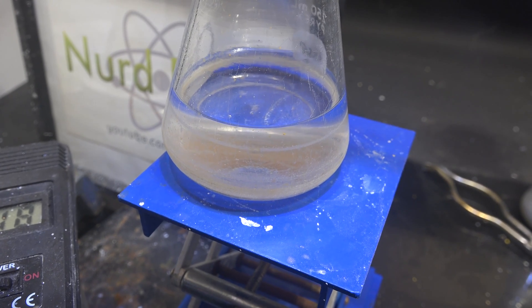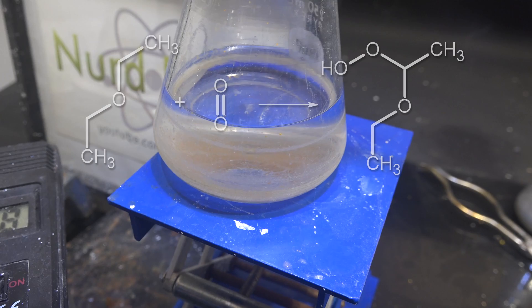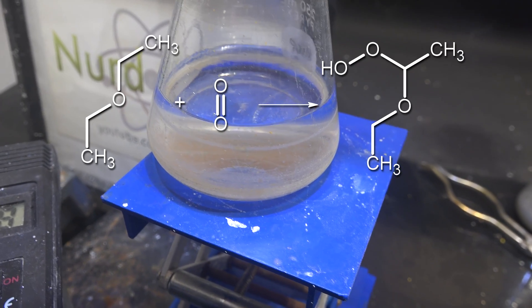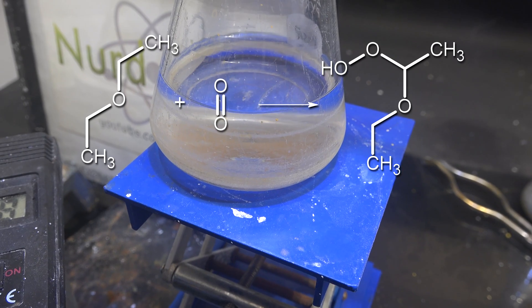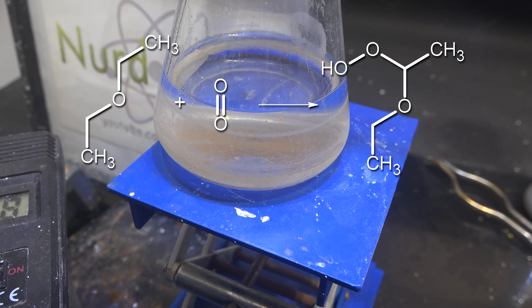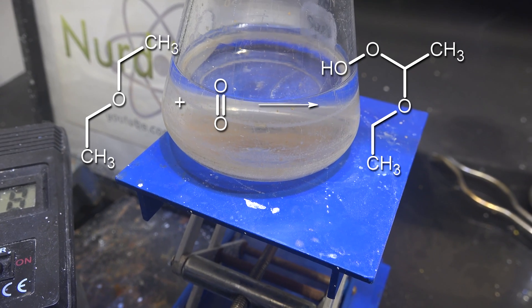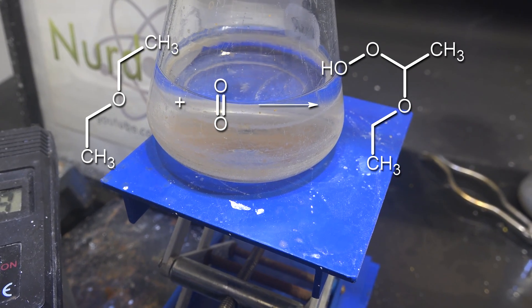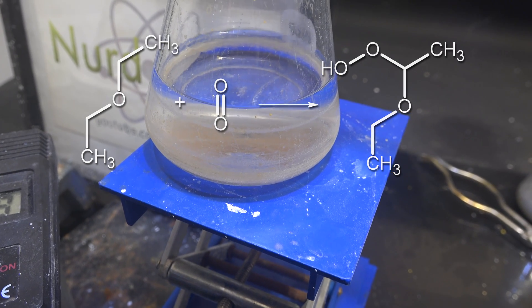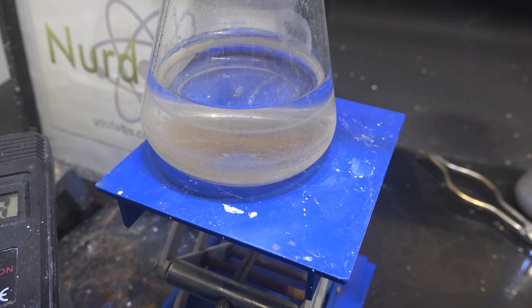Now a special note about long-term storage. Diethyl ether, like most ethers, is notorious for reacting with air and light to generate highly explosive organic peroxides as it sits in storage. This is relatively safe in small concentrations, but if you evaporate the ether or distill it off as you would for solvent extractions, then the peroxides would concentrate in the residue and explode. So don't keep diethyl ether for extended lengths of time. Use it within several months.